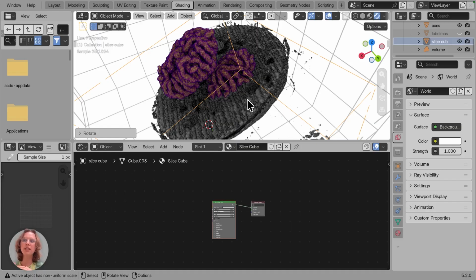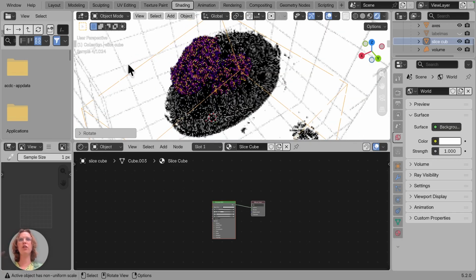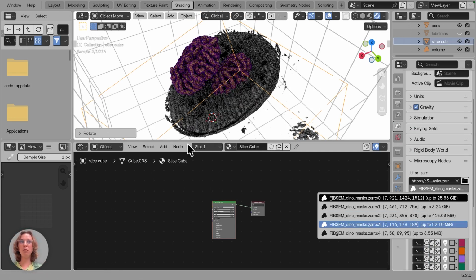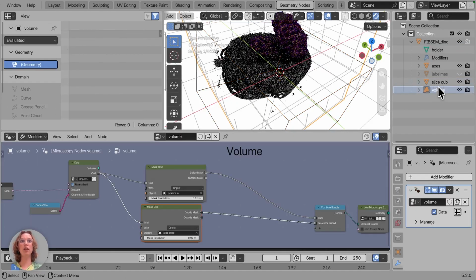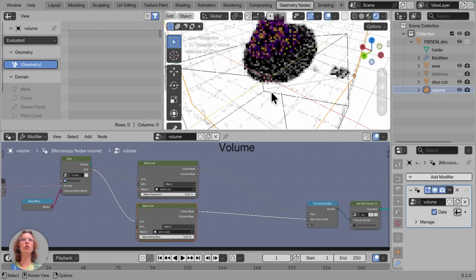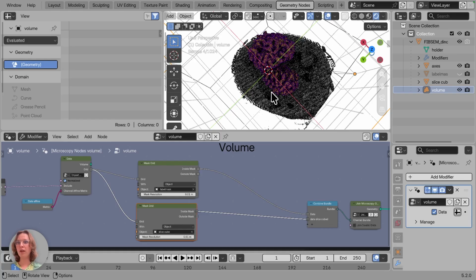In our normal shader-based slicing, we will just get a completely smooth surface if we rotate the slice cube, because that is all calculated on floating point position of the traced rays. But here, because we make this jagged array and then just send the array into the shader, this can cause these kind of artifacts, which is striation. If we now scale this up and go to a higher resolution, it will make some of this better. However, this is a feature that will always exist in here, and that's useful to know.